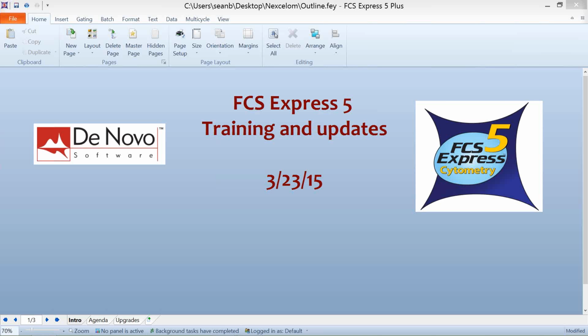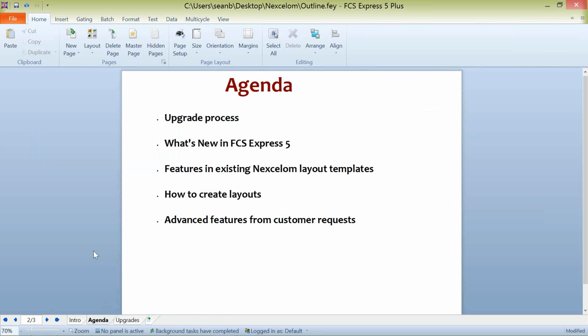And then I also wanted to follow up at the end with two items that I've heard a lot about from Nexcelom customers when we've been visiting people in the field to help teach them more about FCS Express. Essentially two of the most common questions that we get that I think people in the field with Nexcelom can probably address and make the customer's life a little bit easier going forward. Two specific features, so I'll come back to that. Just to outline this again, this is the agenda for today.